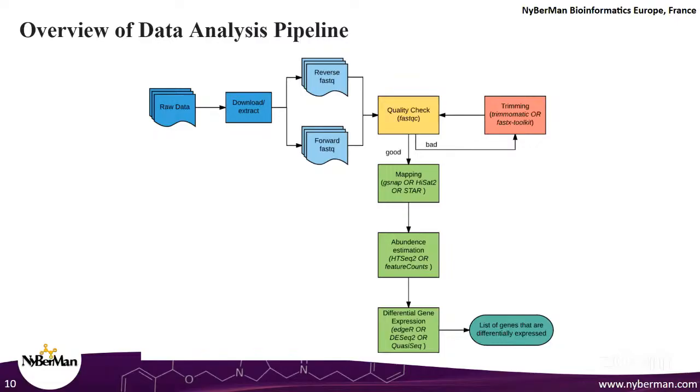And as a matter of fact, as part of your mini projects, you guys will be performing data download from these databases directly. The other way that you can do is you can extract the data from your sequencing laboratories. If you have outsourced the sequencing to an outside sequencing laboratory, you can actually extract the data from there. If you have an in-house sequencing facility, you can extract the data from there, and so on and so forth.